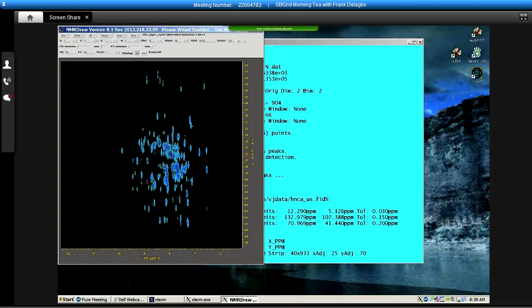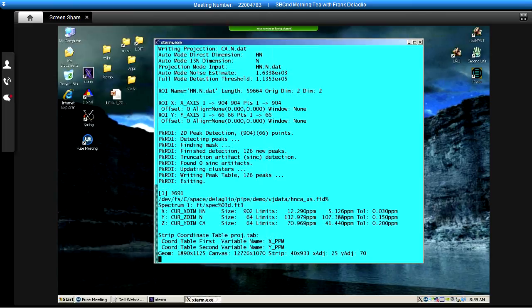Great. So I'll kick off with a question related to that. If users want to find documentation, what would you recommend as a go-to source for documentation on NMRPipe? Actually, NMRPipe is widely used enough now that you can simply use Google to find things. For example, if I want to learn how to do linear prediction in NMRPipe, I can't start a web browser because of the particular graphics environment that I have going on. But if you just say NMRPipe LP, you'll find the NMRPipe documentation for linear prediction.